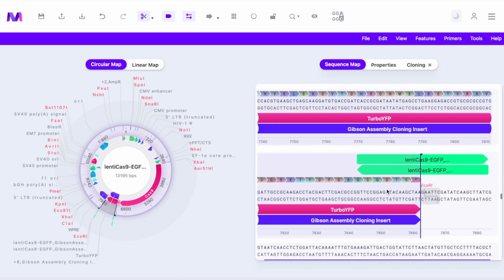Okay, great. That concludes our tutorial on performing Gibson Assembly Cloning in Mendelgen. Please check out our other videos for other cloning techniques.